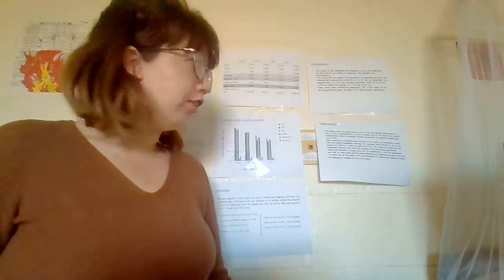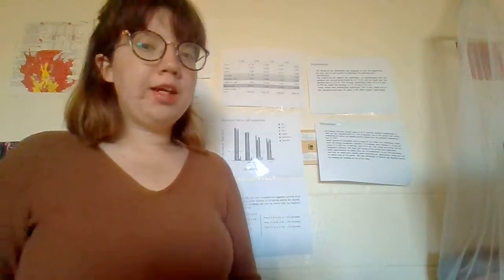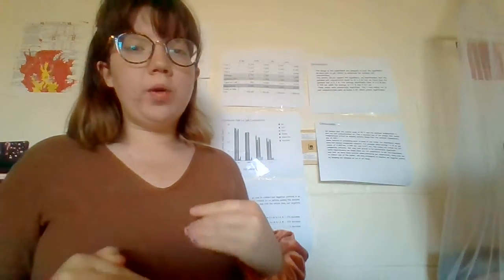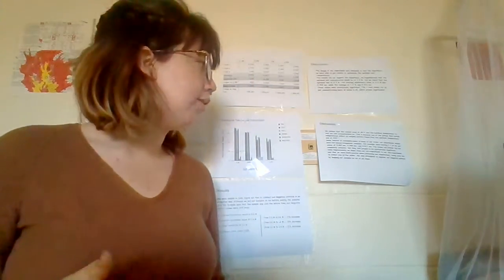In terms of our temperature, we believed that 43 degrees Celsius was the optimum temperature to test our salt concentration at because we found that other groups said that 43 degrees was their optimum temperature. So we decided to test at 43 to try and optimize our enzyme activity.